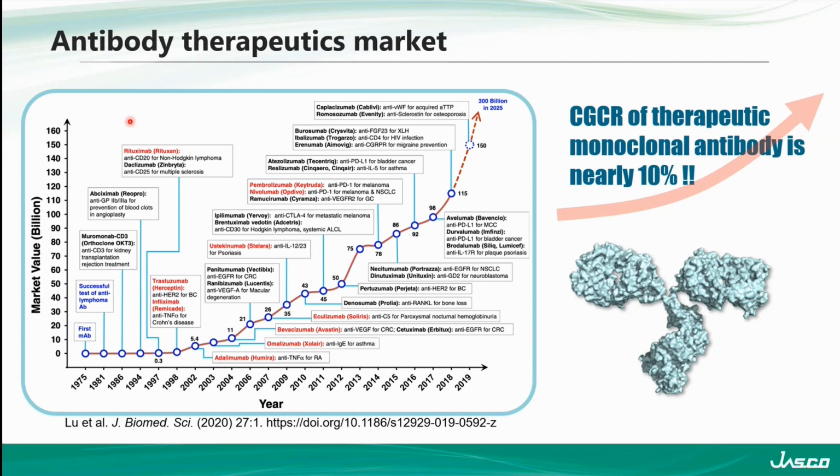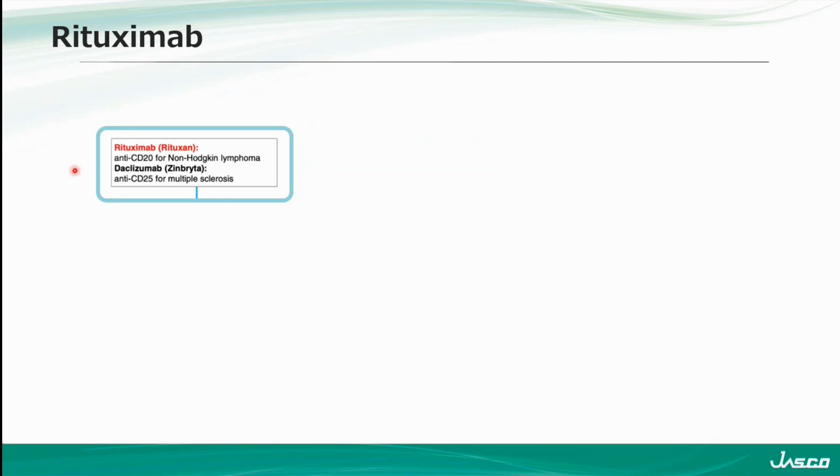And with this growth in the production of these monoclonal antibody, these mAb materials, there was also a growth in ways to study these, right? So you want to look at these materials in a variety of different ways to establish that, one, you have good material, and then two, that material is either long lasting or stable enough for use, storage, and transportation. In particular, circular dichroism is one of those techniques that have been primarily used to study the structure of these proteins.